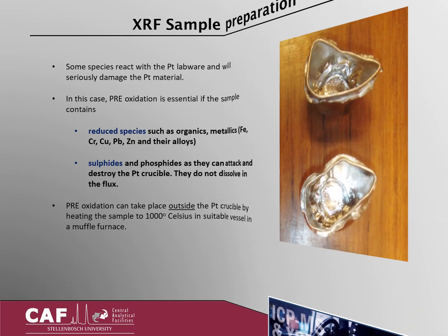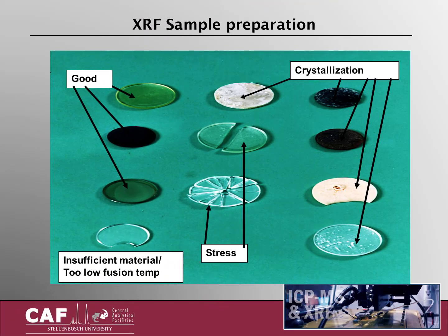in a muffle furnace. Consistent and reproducible preparation of fused beads is not easy and is a science in itself. It takes adequate knowledge and experience in all aspects of the process to deliver good quality fusions. The analysis will only be as good as the fusion. Lacking this expertise may allow for problems to occur, such as non-filling of the mold, cracking or crystallization, bubbles in the fused bead, bead sticking to the mold, and inhomogeneous dissolution. The aim is to create a good fusion which is perfectly flat and completely homogeneous.